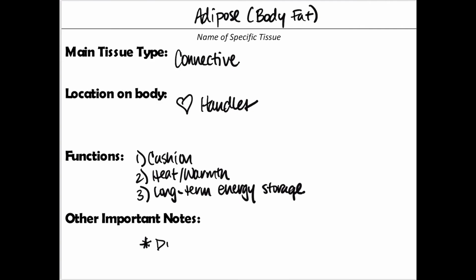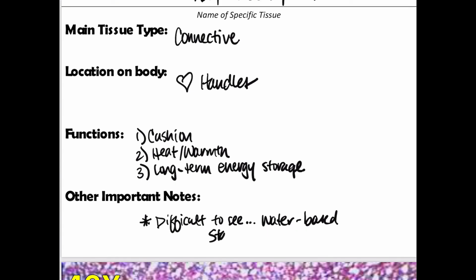this is difficult to see. And that's difficult to see, recall, because the stain does not adhere well to, I'm just going to say the water-based. Doesn't adhere well to fat.